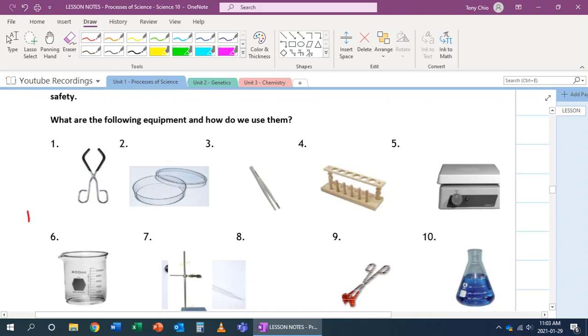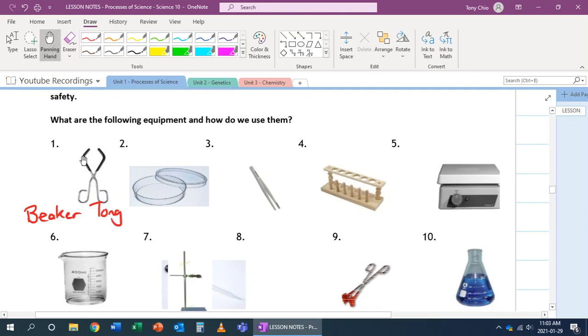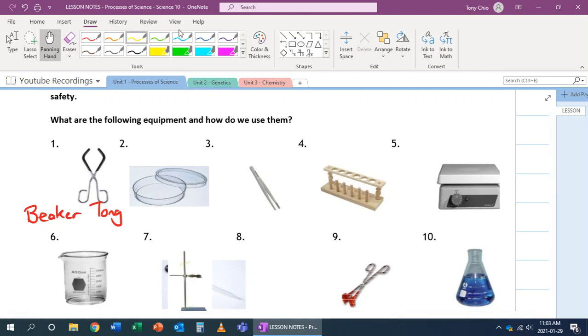So the first one, this one is called a beaker tong. A beaker tong is used to pick up a hot beaker because what happens here is two things. Number one, beakers when you're putting on hot plates can get really hot, so you need a way to pick them up. Number two, this right here has almost like a rubber coating that will help grip the beaker for you.